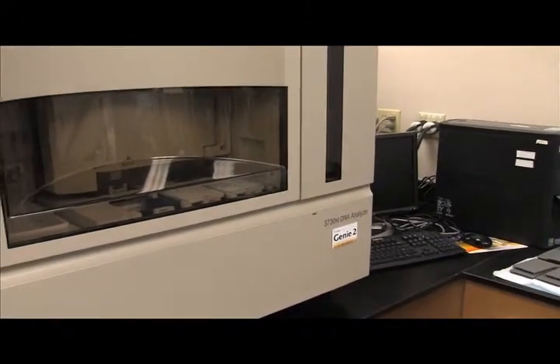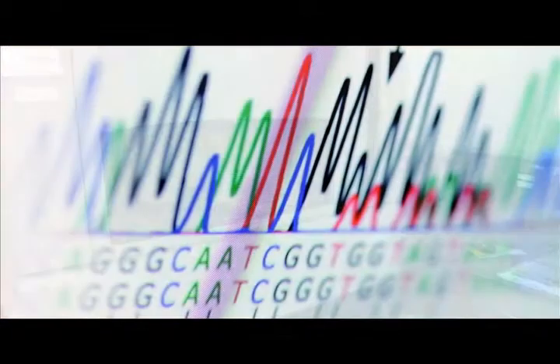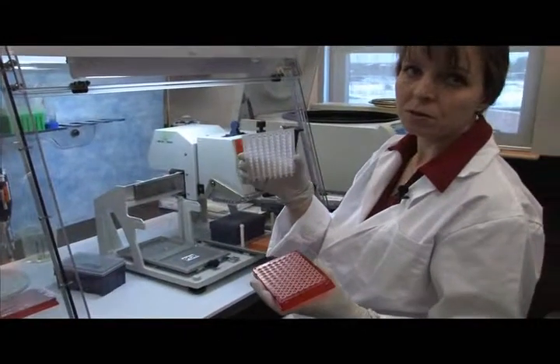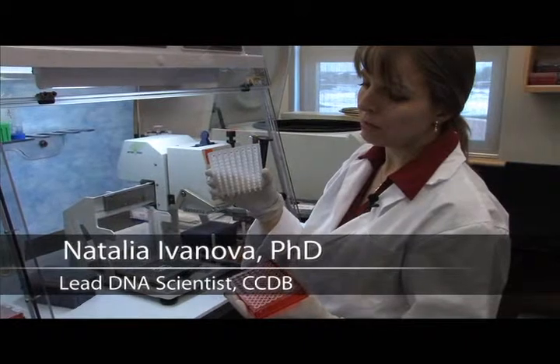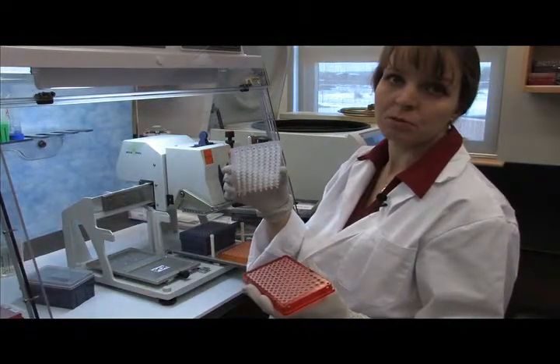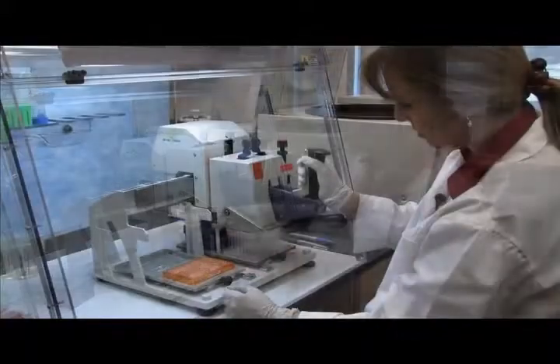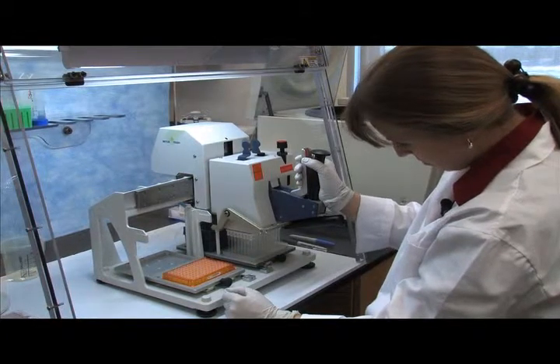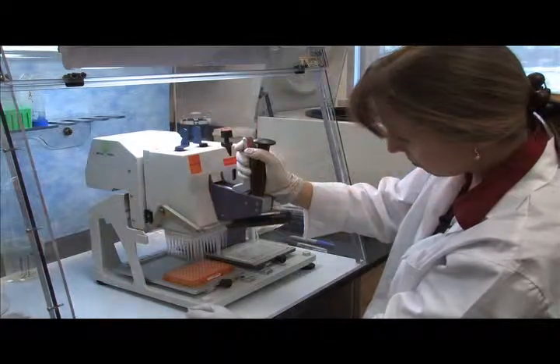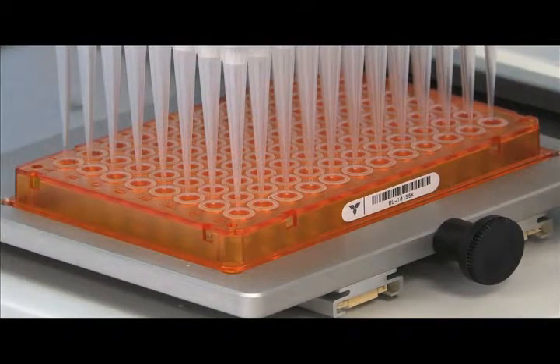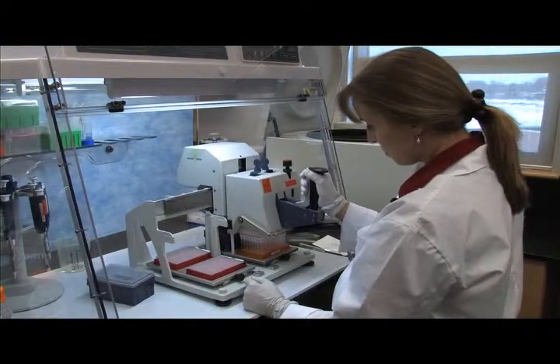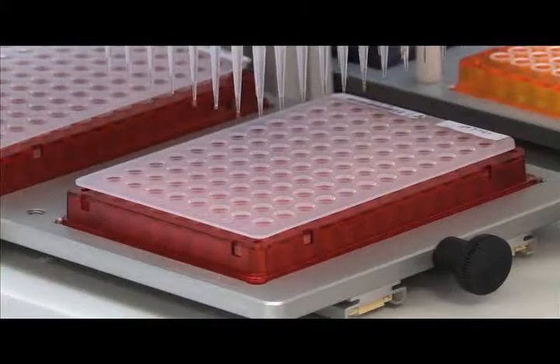One of the analysis methods used in the lab is cycle sequencing. This is performed in order to obtain a nucleotide sequence of the barcode region. This is pre-made sequencing plate containing big dye terminator sequencing mix and everything required for cycle sequencing reaction. Prior to cycle sequencing, PCR products are diluted three-fold with water using Liquidator 96. Use clean tips to add sample into cycle sequencing the PCR plate containing dye terminator. In order to set up the cycle sequencing plates, two microliters of diluted PCR product is added to two pre-made sequencing plates, each containing different primer.